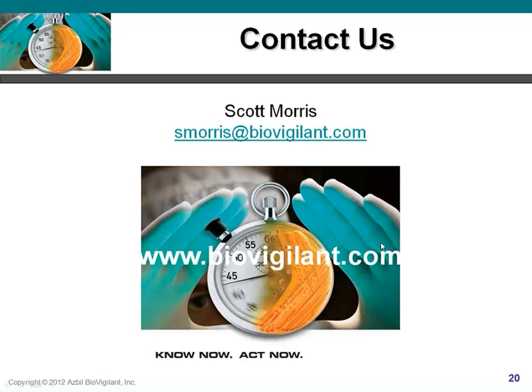Okay, well, here's the first question that we have. Let's talk about it. It's a good one. Do your customers typically use the IMDA system to completely replace air sampling, or do they use it in addition? There's probably not one answer that can satisfy all the possible shapes that situation could take. It really depends on the application.